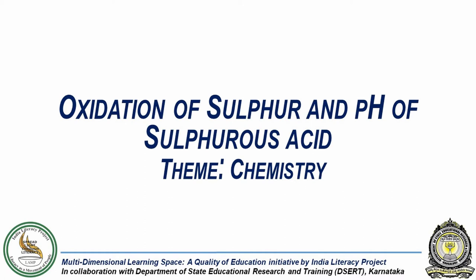In this experiment, we will demonstrate the oxidation of sulfur and investigate the pH of sulfur dioxide and sulfurous acid.